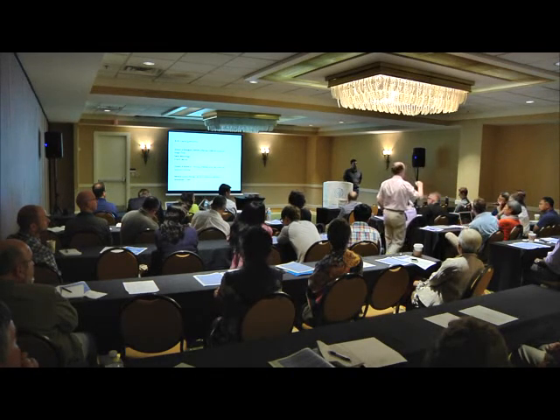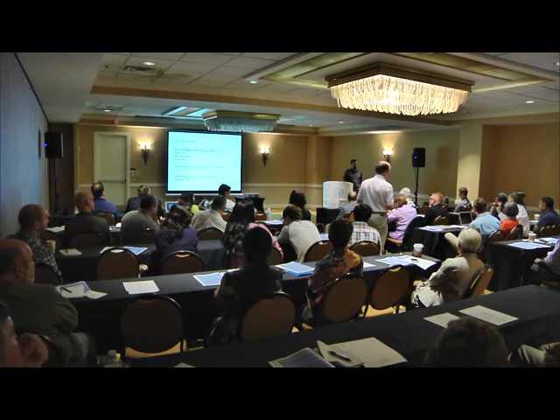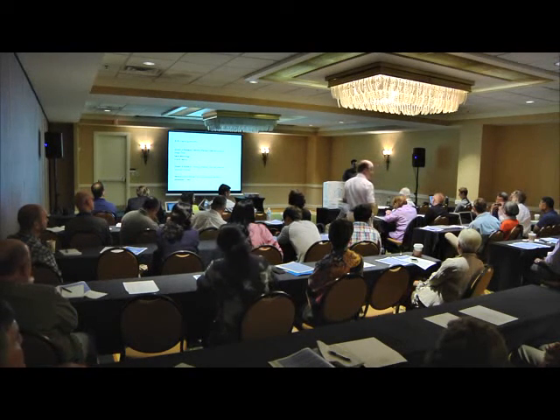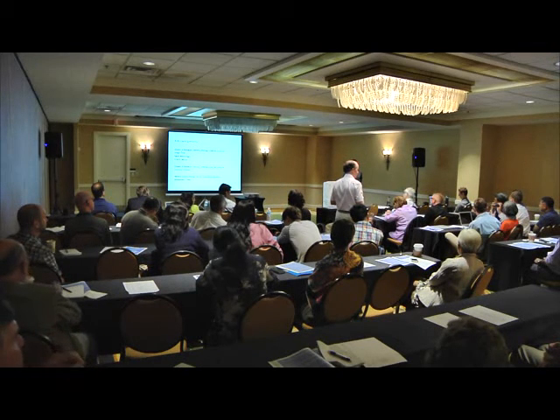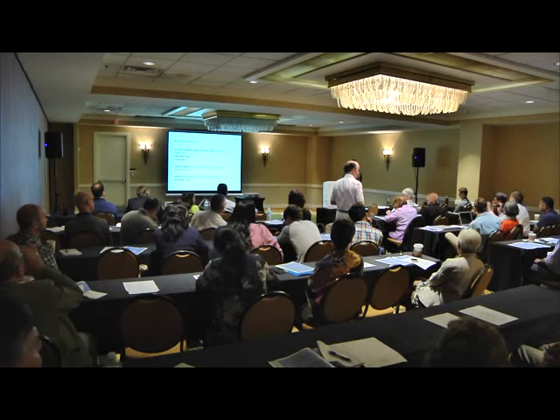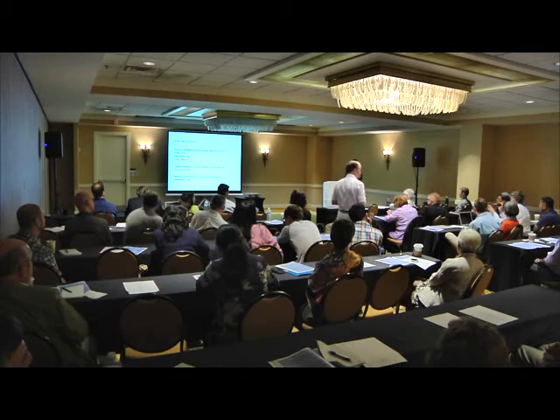People have been trying to make the fragmentation stereo-specific. This is something that has never really been brought to a really applicable stage. But I think your method could be useful in validating different fragmentation techniques that are available in better instruments than the one you have, of course. Yeah, you would eventually have to move up a little.